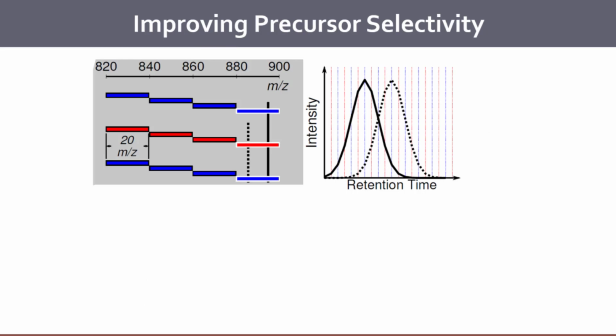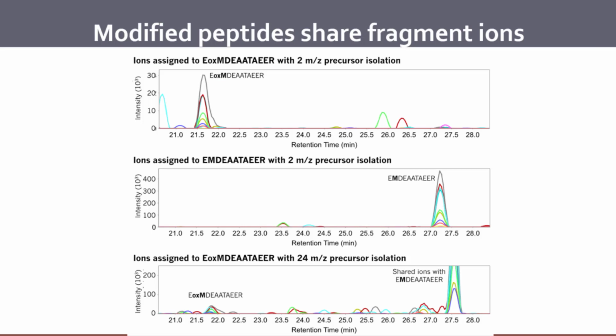So one way also to solve some of these problems is to... Yeah, it's very important. We don't have any way to know from DIA exactly which ions are capturing the oxidized amino acid. There is no criteria, like the intensity you mentioned, so it's not like when you have an MS/MS and you have the m/z, so there will constantly be a problem.